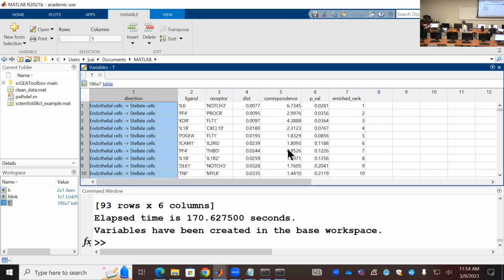Okay. So at this step, if you've already annotated all the clusters with their own cell type, would there be a difference between the cluster ID and cell type? That will be different. The cluster ID will be original if you separate it into 100 small clusters. Cell type is by name.